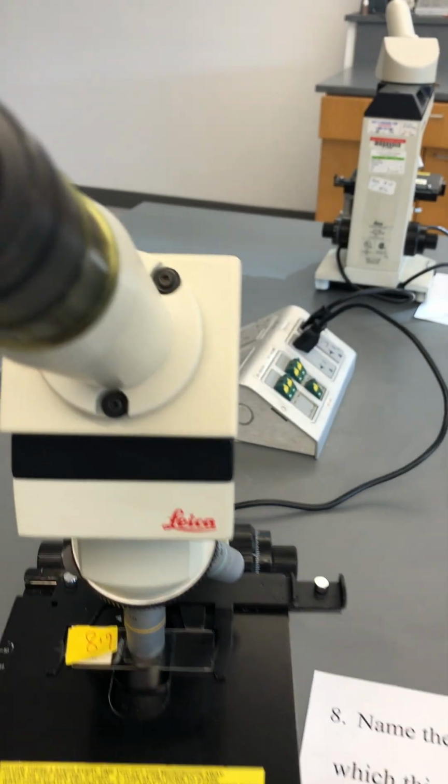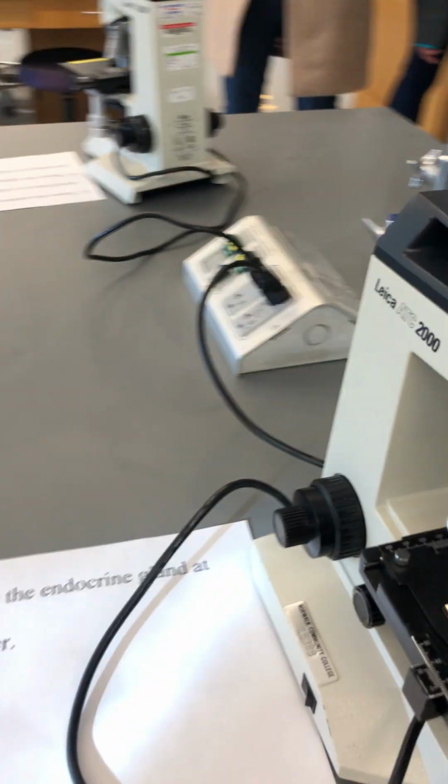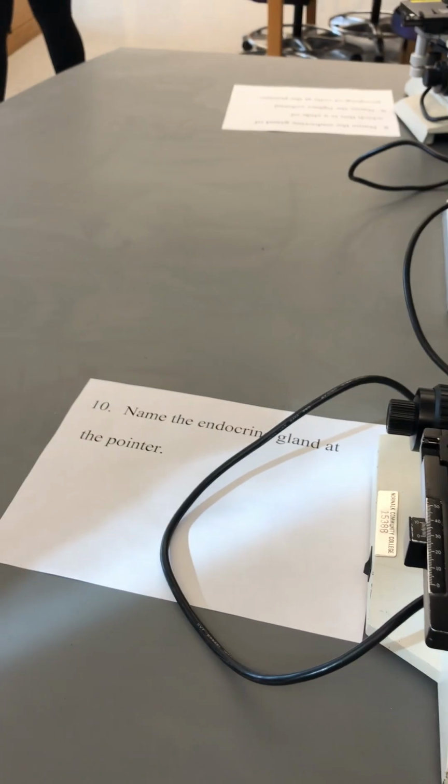Number 8 and 9, this slide was the pancreas. And 9, the lighter colored area is an islet. There's a couple of them in the view here under the microscope. Probably slide 8 and slide 6 were the more difficult ones to get.